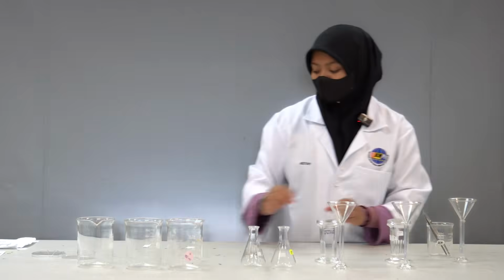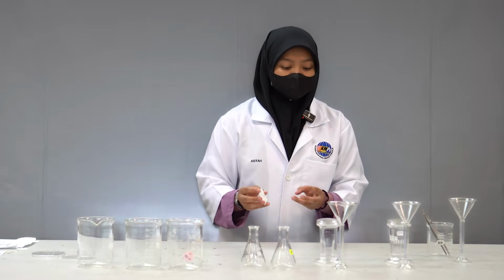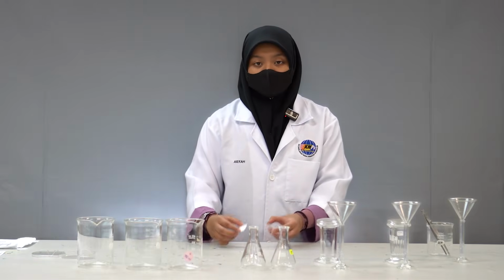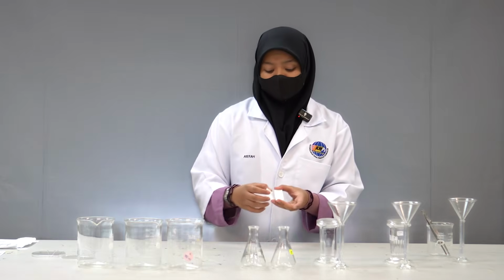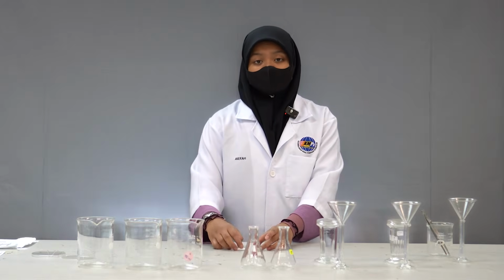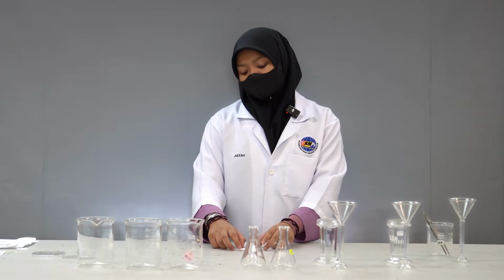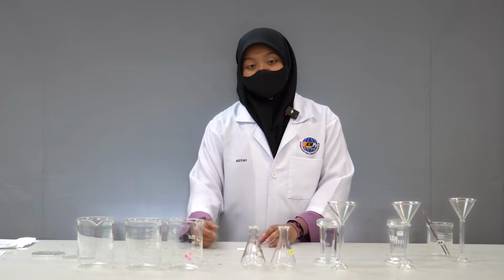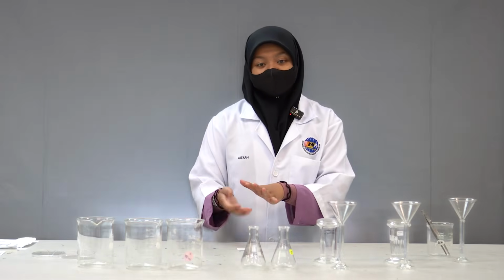Okay. So we have these two thin layers that we already put inside the chamber, and now we want to see the result, because we can't see the result now. So we're using the UV light with a short wavelength. Okay, so assuming that I have the UV light, and as Sister Amani said, we shield ourselves with the plastic, right?